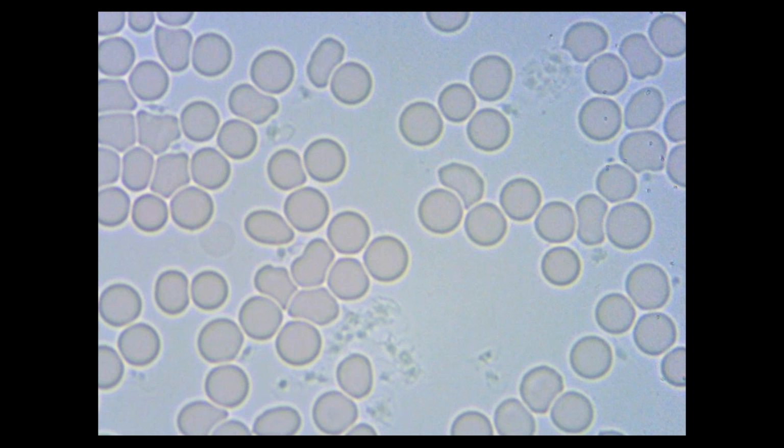So there are quite a number of factors to consider when choosing a microscope for live blood analysis, and it seems that dark field plays a very important role here. Now, you mentioned earlier that there are many anomalies that can only be seen in dark field and that these may be very important to the treatment of the case. Could you tell us a little bit more about this? Which anomalies are only visible in dark field, please?